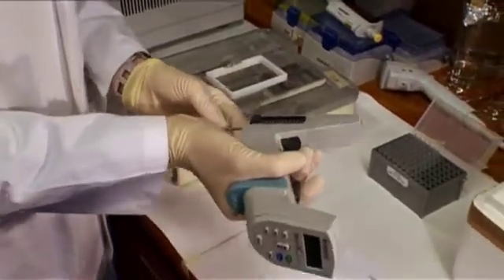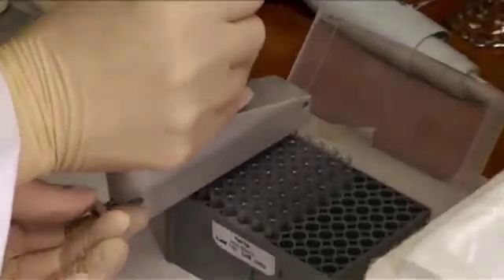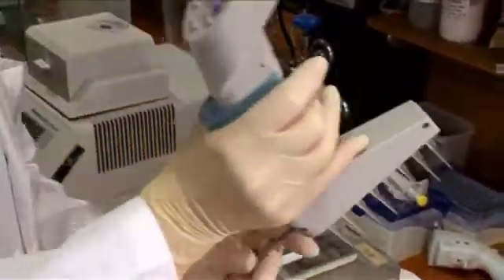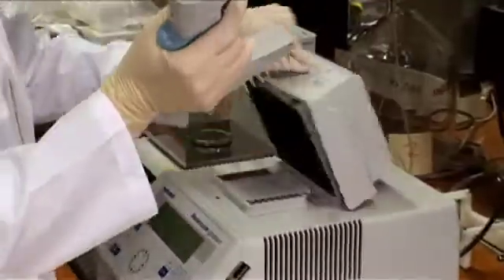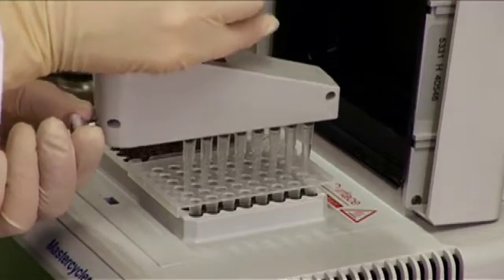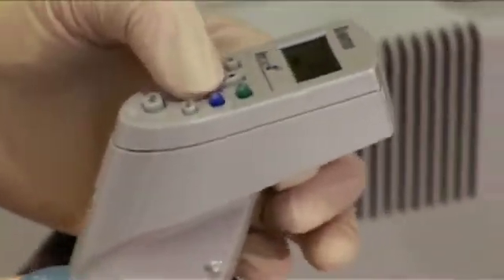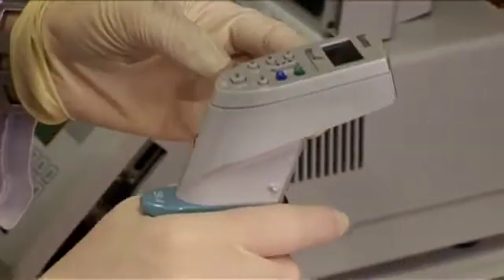And then I will transfer the samples, which is here on ice. And for that we use this multi-pipette, and here we can adjust distance of the tips. So it works in an Eppendorf rack as well as a 96 well plate. The samples are transferred to the agarose, which is on a 37-degree incubator. The tips with agarose and cells mixed together and dispense them on this cold gel bond film.